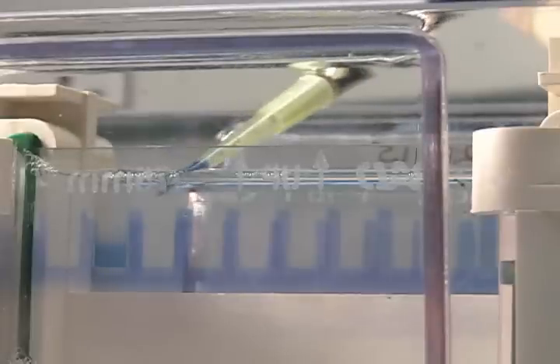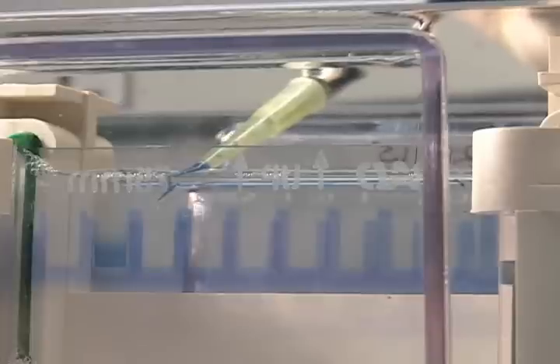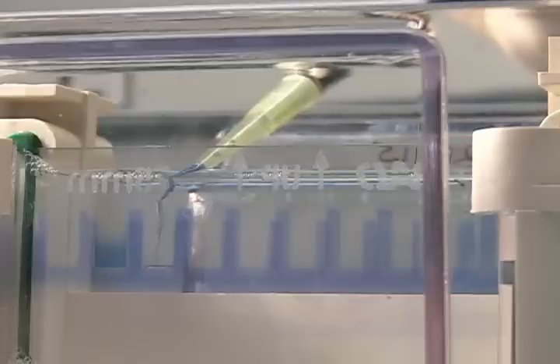Almost always these protein samples are going to be in a sample buffer that contains SDS and beta-mercaptoethanol — which is the lovely smell — and bromophenol blue, so you can actually see it loading.